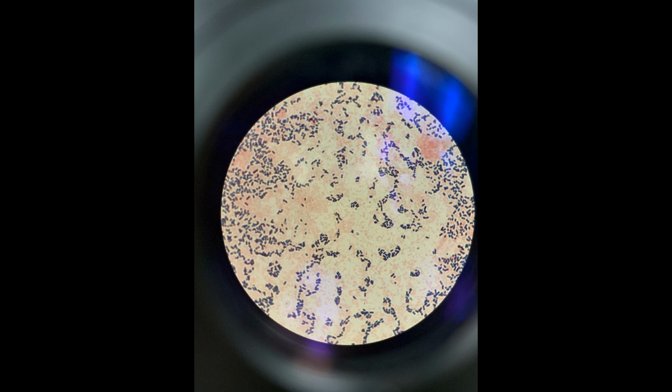It's been a long time since I've done a Gram stain, and I was a little bit afraid that I was going to have to actually show you guys an image from the internet. Not an image that I took myself, but here we have a Gram stain of a mixed culture that I did myself. This is a really critical skill to have, and I'm very sorry that you're not getting the opportunity to do this with your own hands. But if you ever do get the opportunity to do this type of staining, I highly recommend that you take the time to get to learn how to do this.